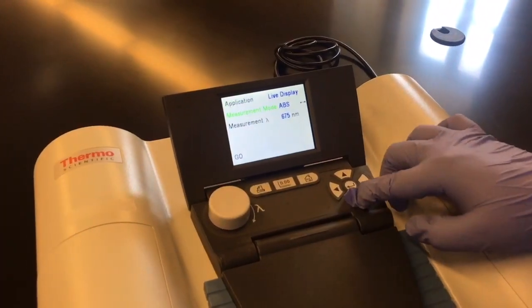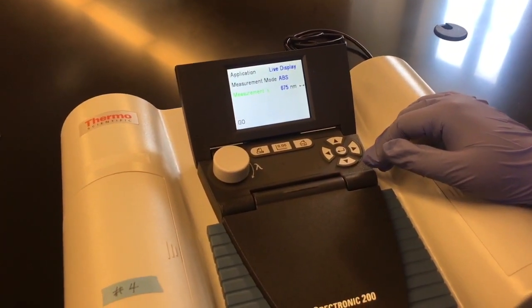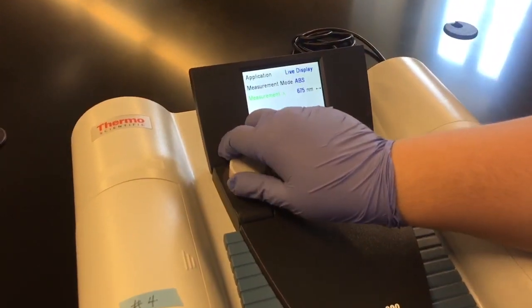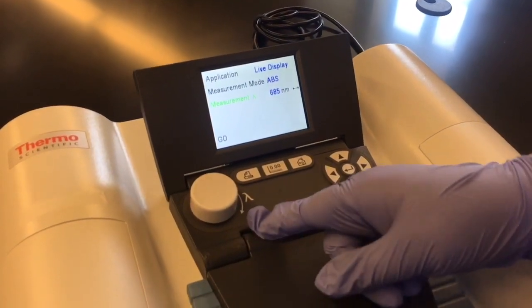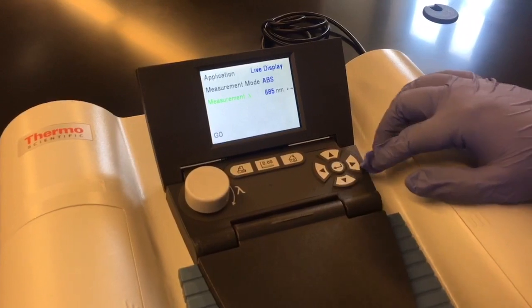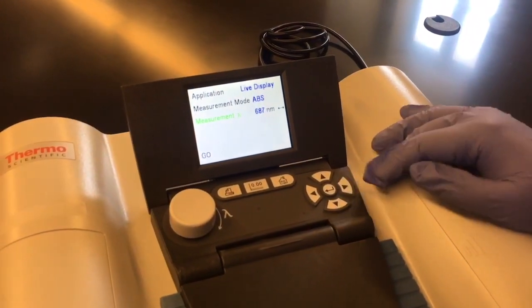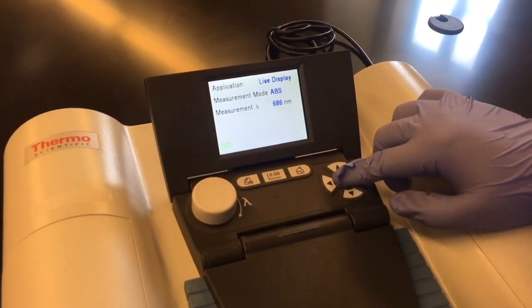This is where you can select the measurement of your wavelengths, and it depends on what your professor asks you. But for our example, we're going to set it to 686. You can use this knob to adjust the length by bigger intervals, but if you want to get more specific, you can use the keypad. I want to set mine to 686, then press down and go to go.